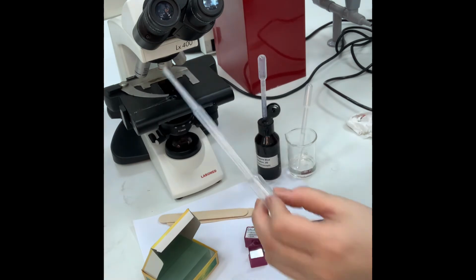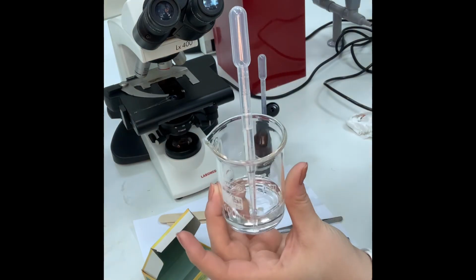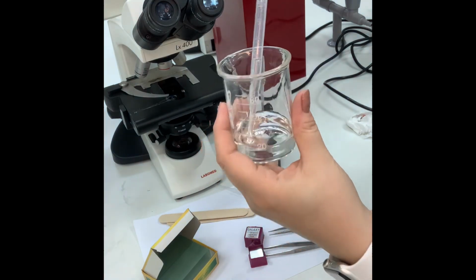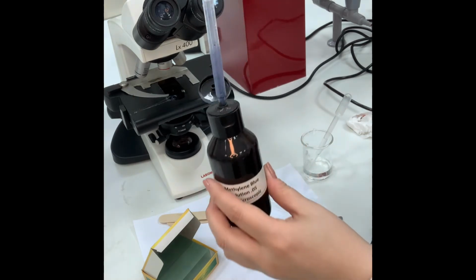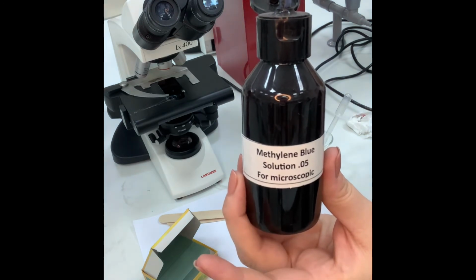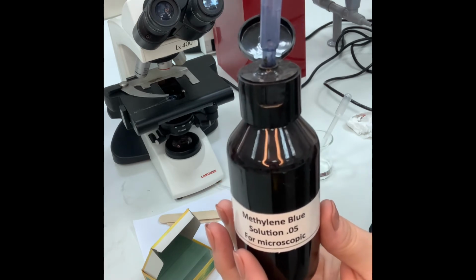to view the cell. The liquid I'm using is water, very simple, but with the water I will see the image colorless, without colors. And in order to see the image colored, I'm going to use a stain. Now I can use methylene blue, this one. I can use iodine, I can use methylene red. It's just a dye, like an ink, let's say.